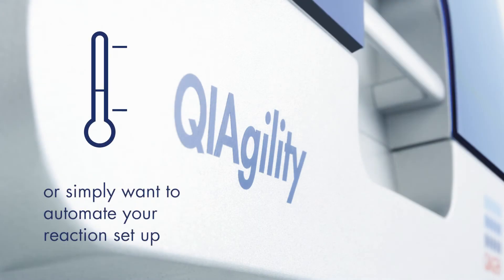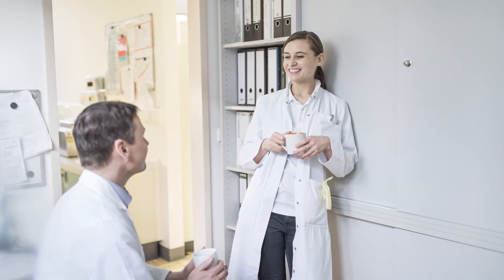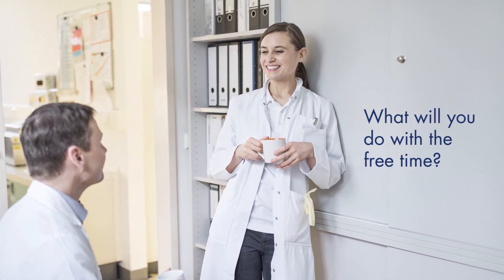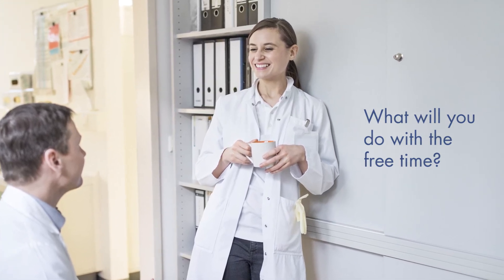Automation is easy with Altac's outstanding room temperature stability. Altac's versatility, performance, and integrated controls allow you to focus on more important things.